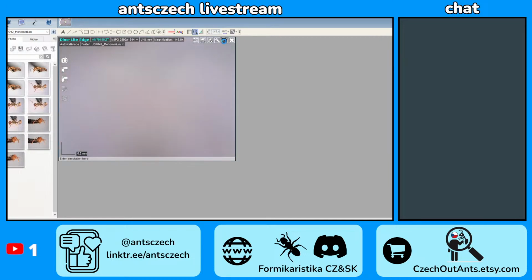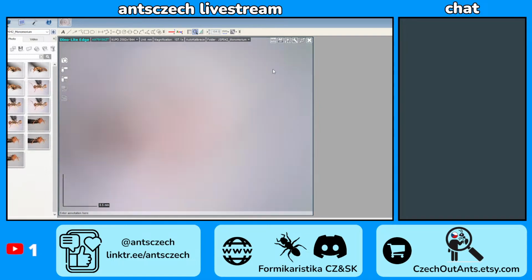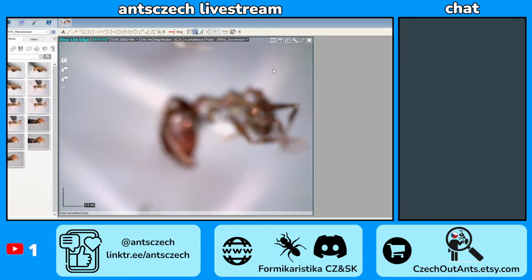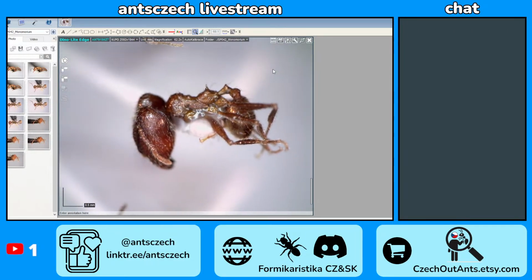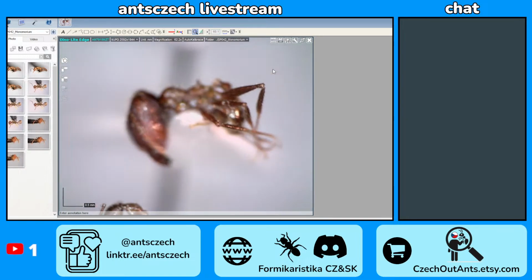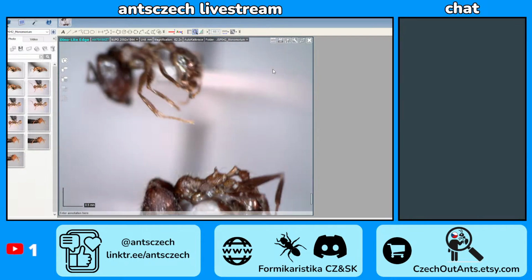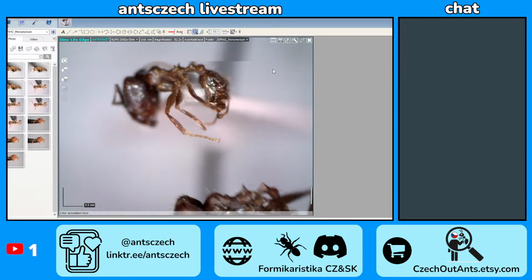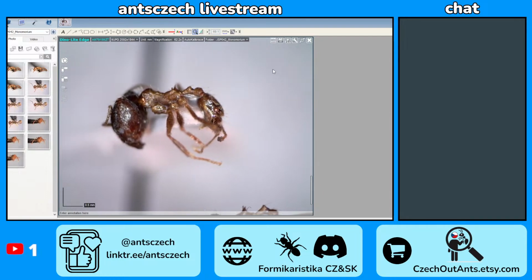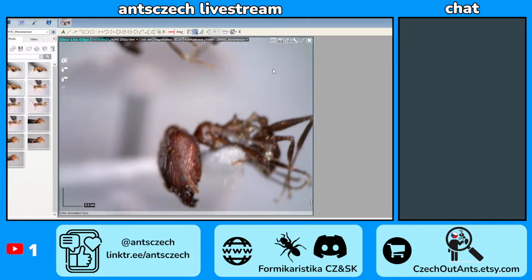Okay, let's go. What's 180? Hopefully. Is this enough? 60. Oh, yeah, it is enough. I present you a random Pheidole from... Oh, it looks like it's trimorphic, or is that just bigger?